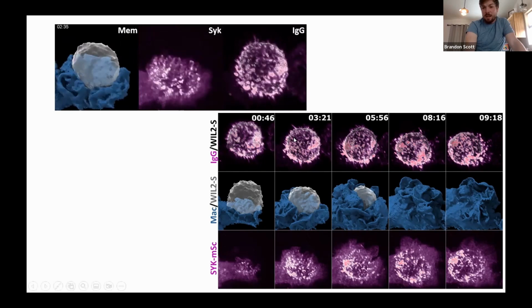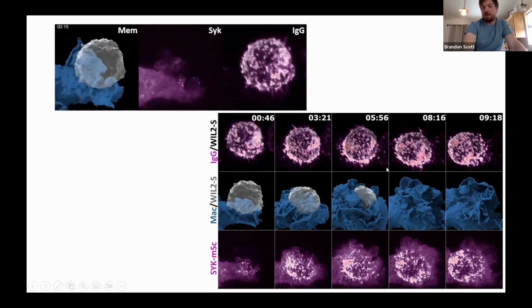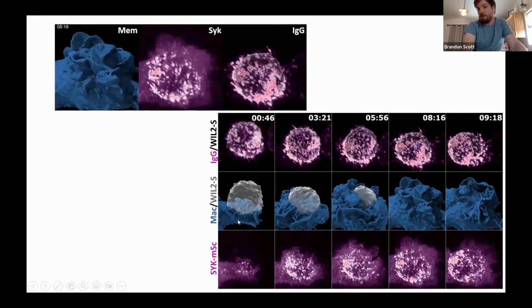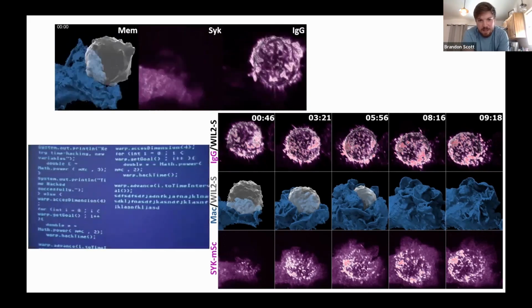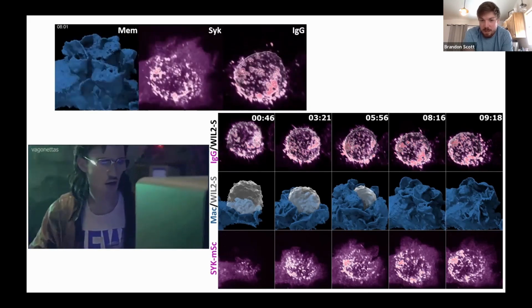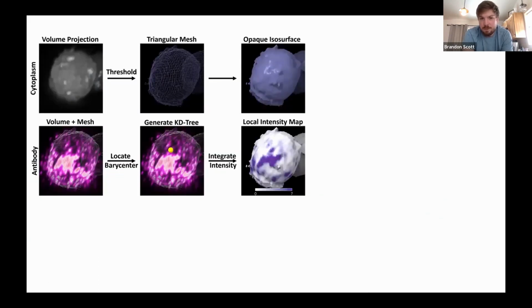And so this is where most of the data end up looking like, where we're just, take a montage and you're like, yes, we can see where it is, and start to visually see how it's changing over time. And so that's like the next step is really getting to this point where it becomes a very computationally intense problem to try and solve. And that's where we're really working to move towards.